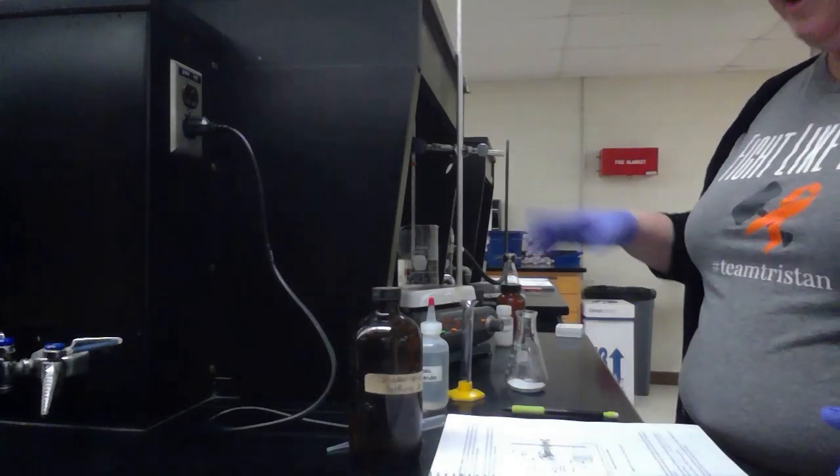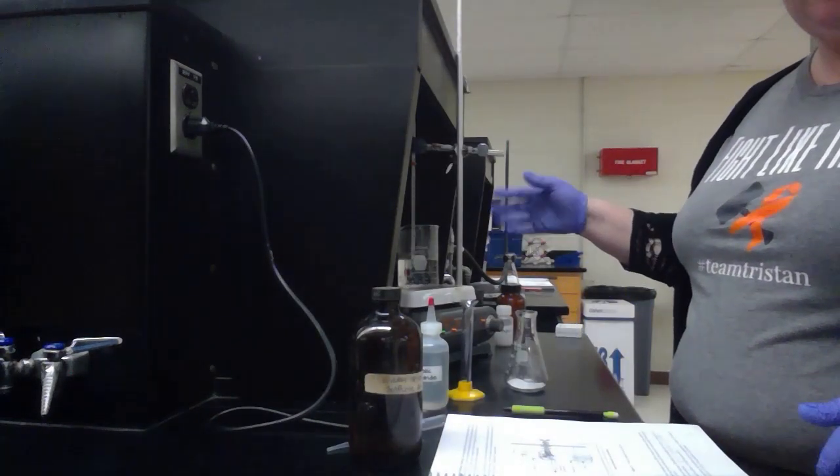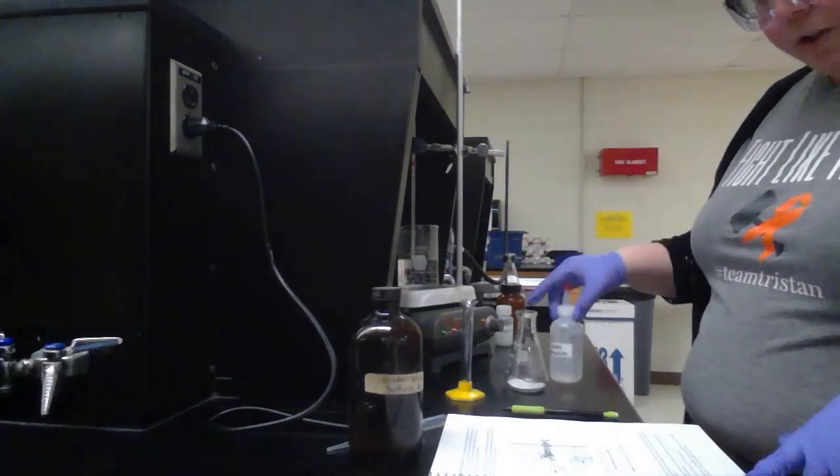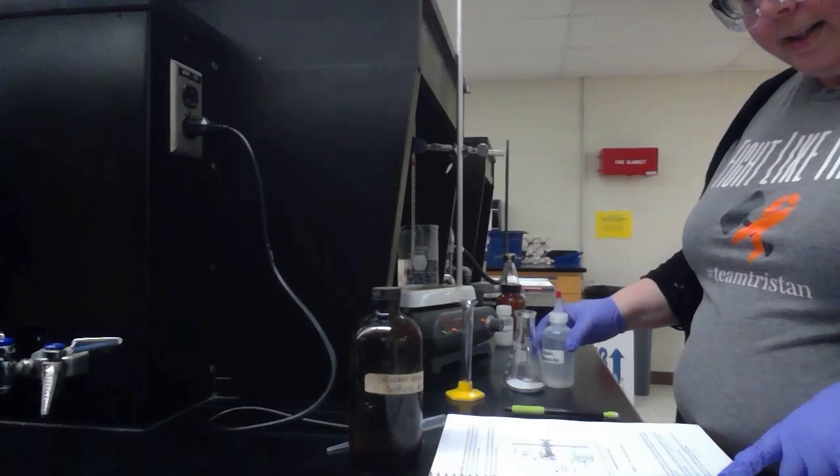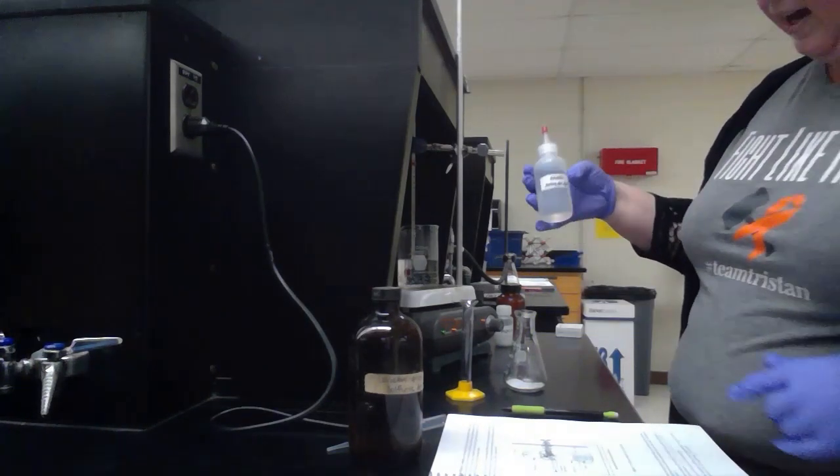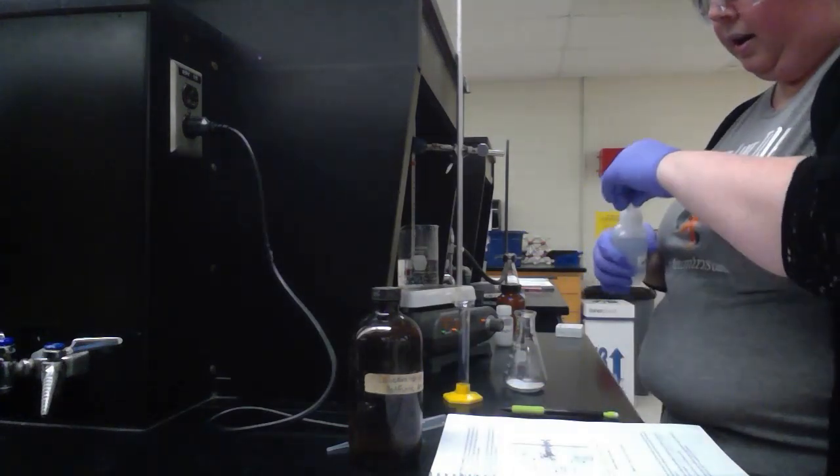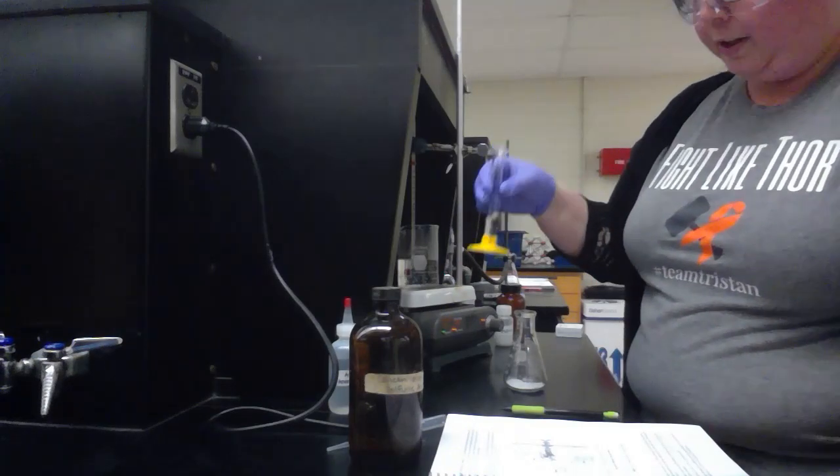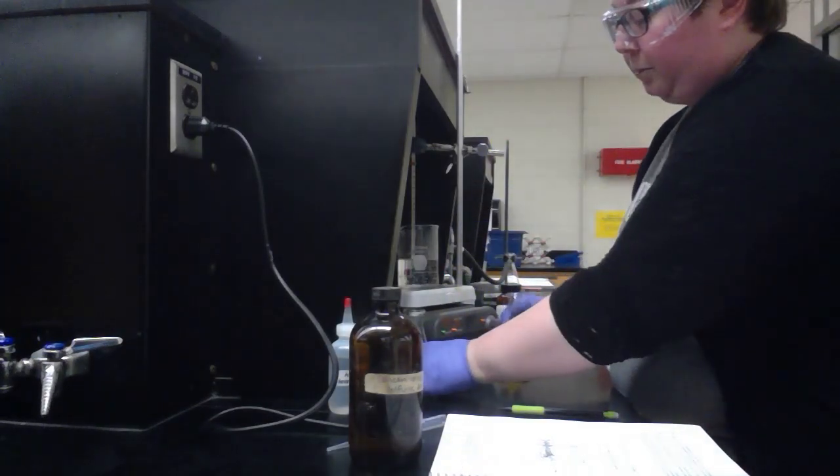Now that my water bath is up to the correct temperature, I'm going to follow the procedure. The next thing I need to do inside the personal fume hood is add four milliliters of acetic anhydride. I'm going to measure that out in my graduated cylinder. I have four milliliters of that under the personal fume hood.